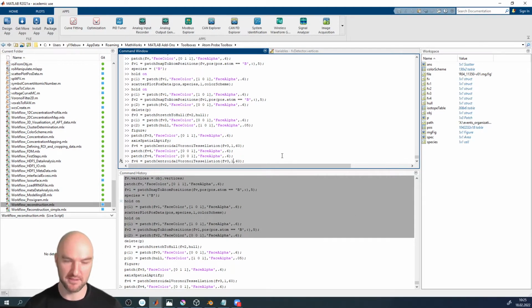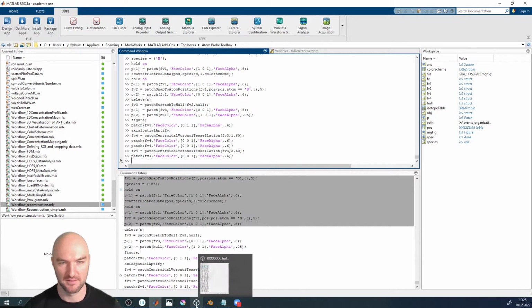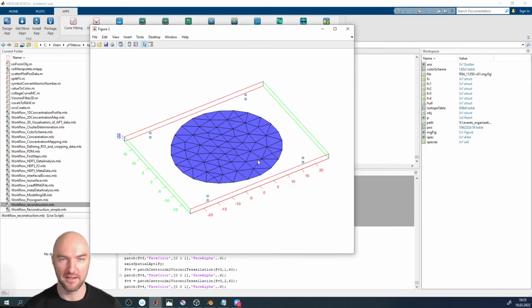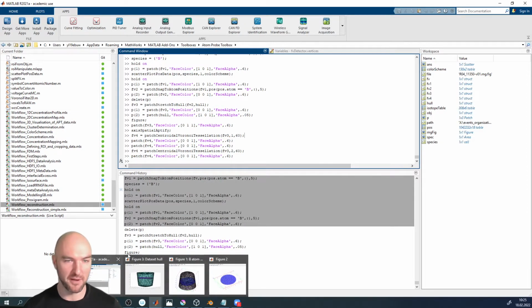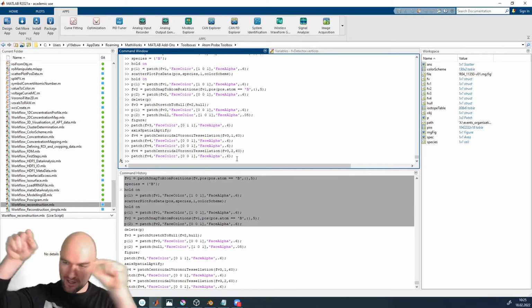Okay, so what happens if we run 2 CVT steps? You can see it didn't change all that much anymore, so it converged really quickly. As a last thing, we might want to plot that on top of our nice atoms to see if something is shifted, because we are shifting vertices.